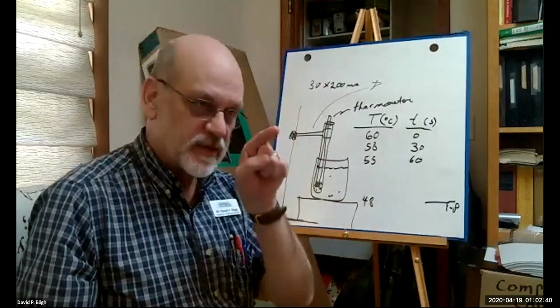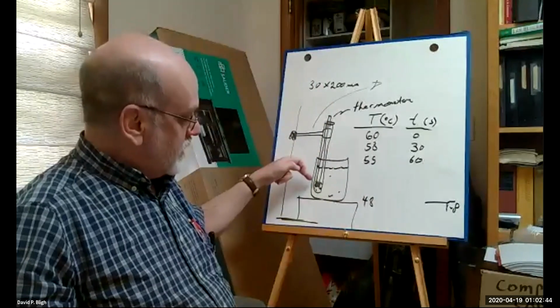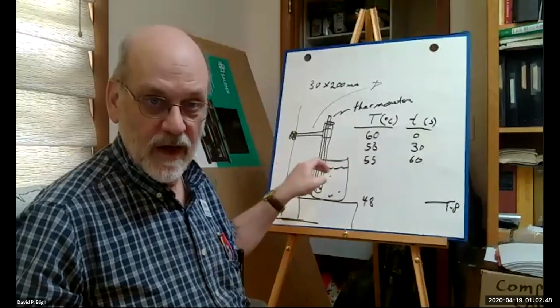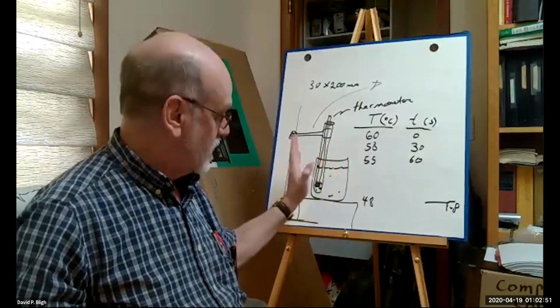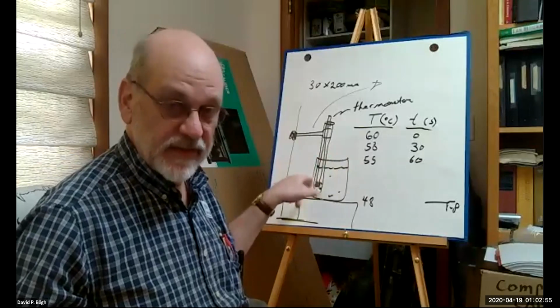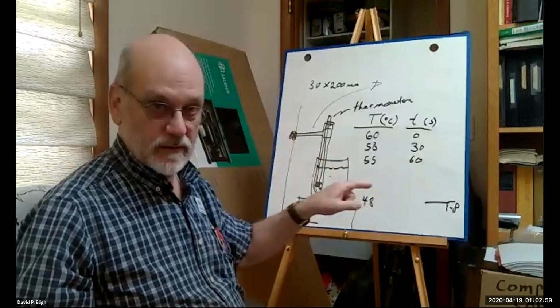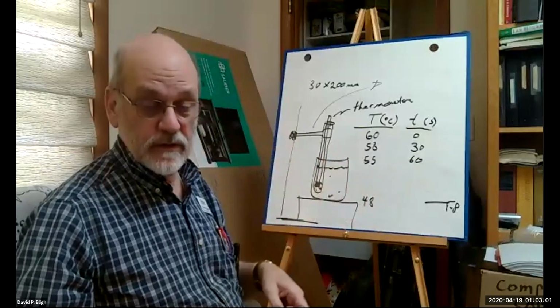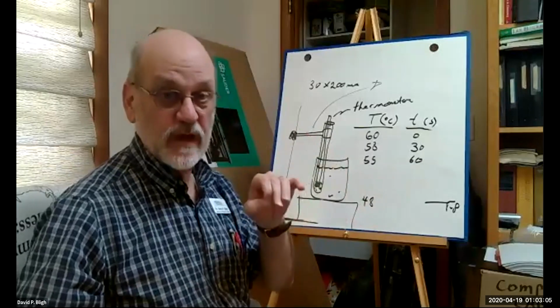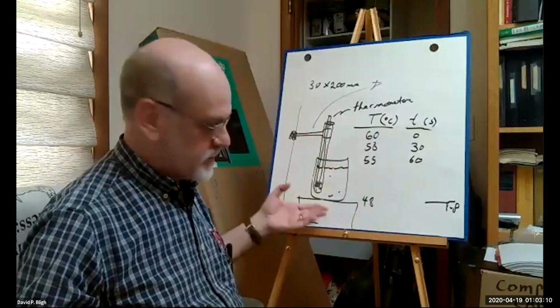Now, you want the solid to be in the liquid, right? If it starts to occur around the top of the liquid or on the inside of the tube, then it's not at that temperature. That's why we need to keep stirring it too, and only stop periodically to look for those pieces of solid that are starting to develop. It needs to be well mixed.